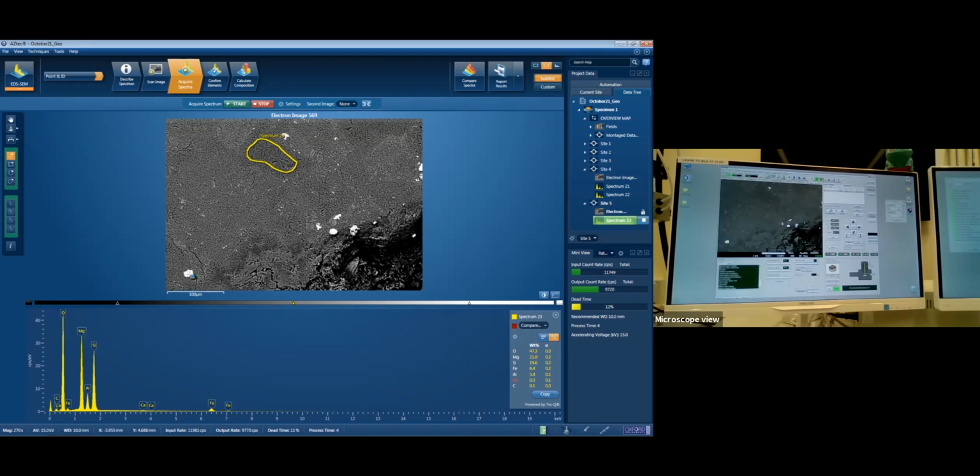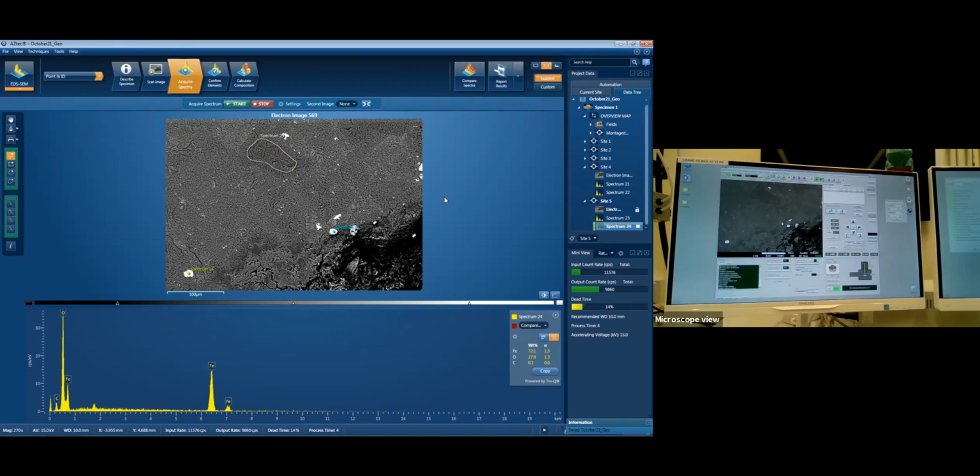And I'll line up a couple of things. We'll check this white blob, and we'll check that white blob, and we'll see what's in there. Just iron. Always a big fan of minerals that are just one thing. You can't really get it wrong. Makes it a lot easier to deal with. Nice and straightforward. Yeah, a little bit of magnesium, that's fine.